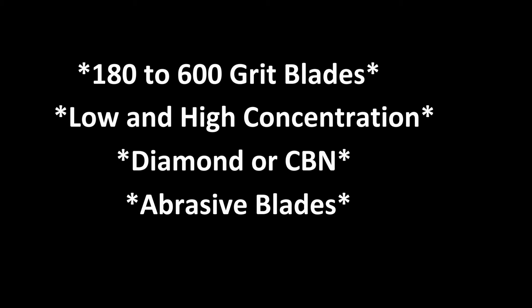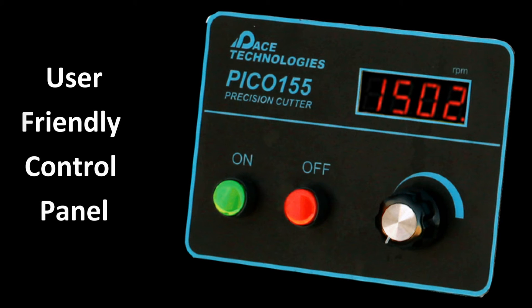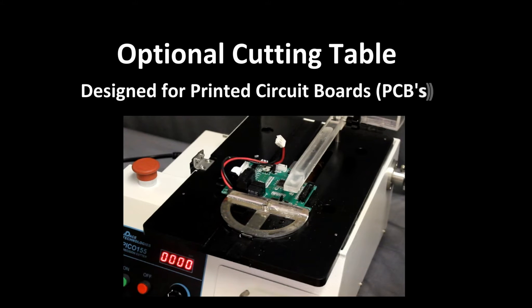Although less common, silicon carbide and aluminum oxide abrasive blades can also be used on this saw. The Pico 155 is very easy to use with simple on/off buttons and a potentiometer for controlling the wheel speed. With the optional table feed attachment, samples such as printed circuit boards can be easily sectioned.